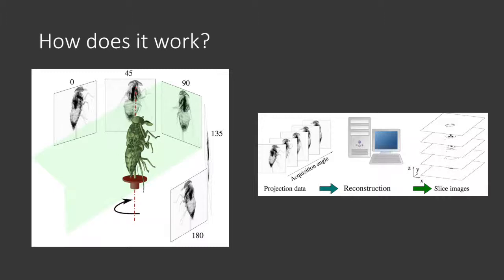Computed tomography is done in two steps. First, you have to obtain many radiographs from different sides of the sample. These radiographs don't show the 3D volume yet, but after the second step, which transforms the object into a volume, you can start looking into the 3D information.